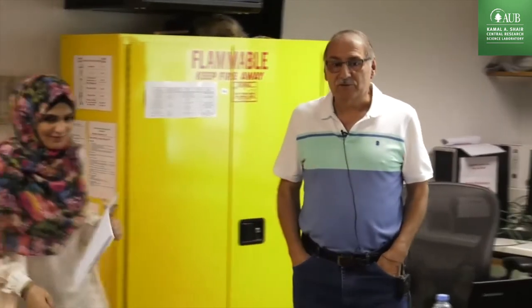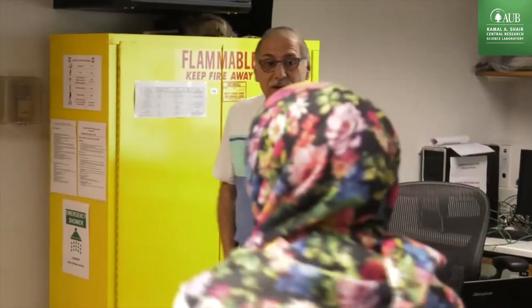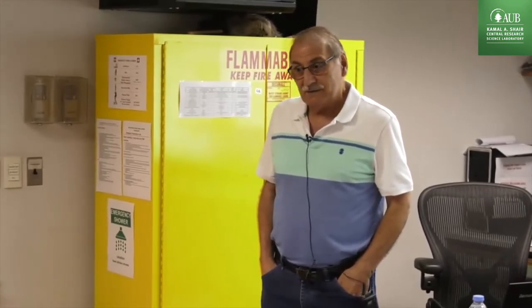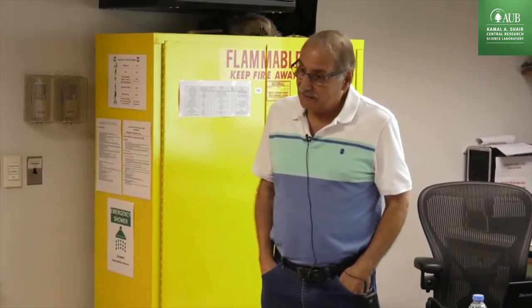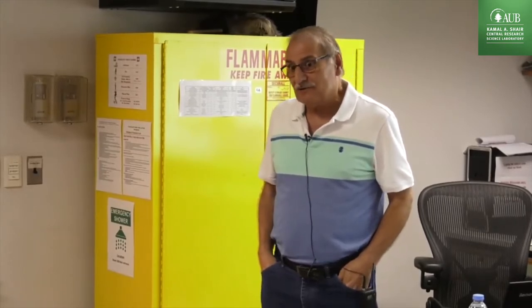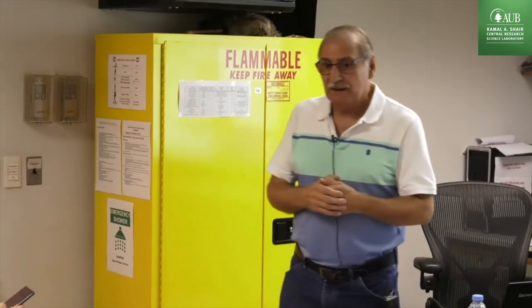If we have a reaction for hydrogenation, we have to select the correct active site, for example, nickel or platinum or palladium, right? Because we need to have a metal which can absorb the hydrogen, dissociate the molecule of hydrogen, and then one atom of hydrogen is going to attack the double bond and hydrogenate, okay?